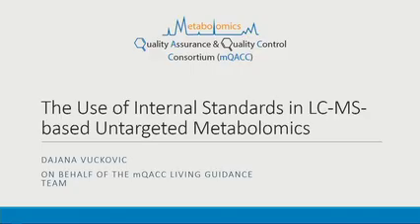Well, thank you very much. Brian Gonzalez, Ghent University. I do have several, but I will do it one at a time to give everyone a chance. I think my most important one is the definition of pooled QC. Here we mentioned that it's a combination of all biological samples, which in my case, I do large epidemiological studies. If you have 3,000 samples, I could not think that I should thaw all my samples. So I think if we are to establish that batches need to have a representation in all stuff, then maybe a QC from batch 1 would suffice, but not for all biological samples.